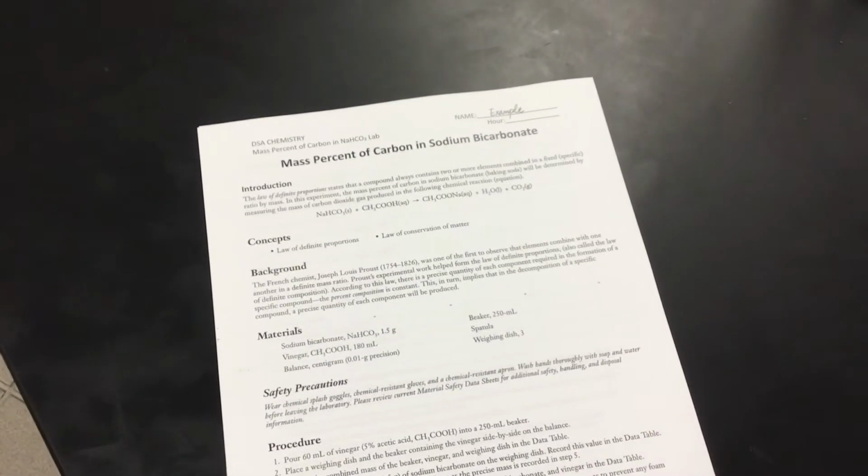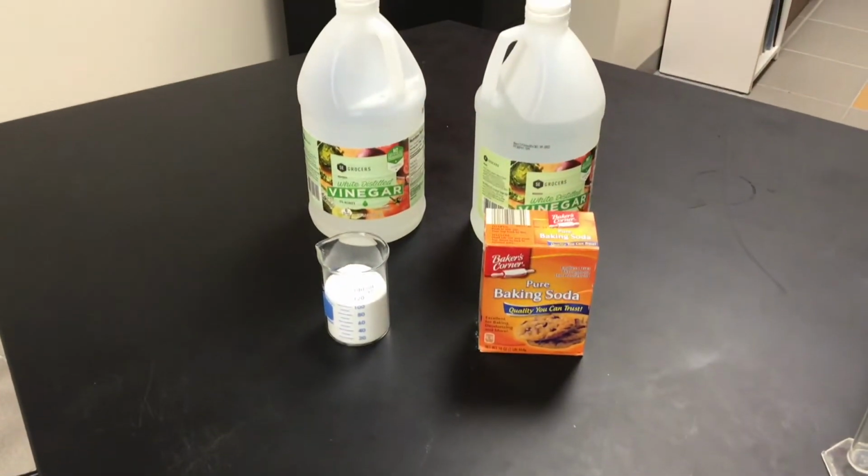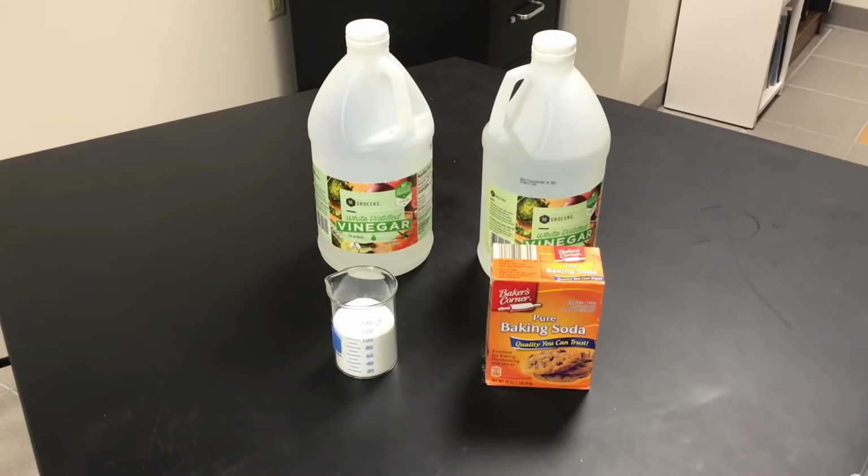This is the mass percentage of carbon in sodium bicarbonate. All you need is baking soda and vinegar for this lab.